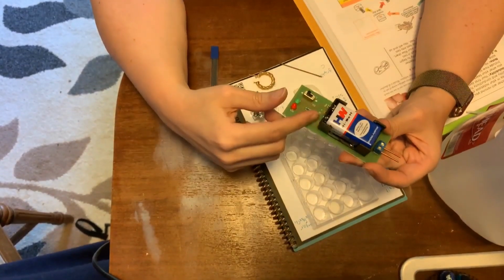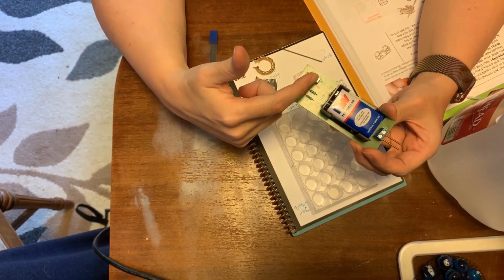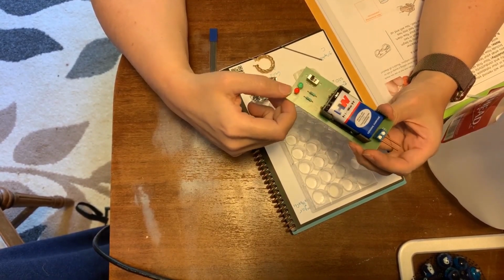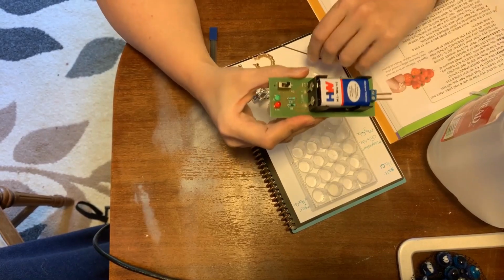Go. So here we have the conductivity meter. It has a battery, it has two indicator lights right here, and it has its on-off switch right here. So first what I'm going to do is something a little bit outside of the directions, which is to test the dry substances by themselves. So I'm going to turn my conductivity meter on, and now I'm going to start testing substances.